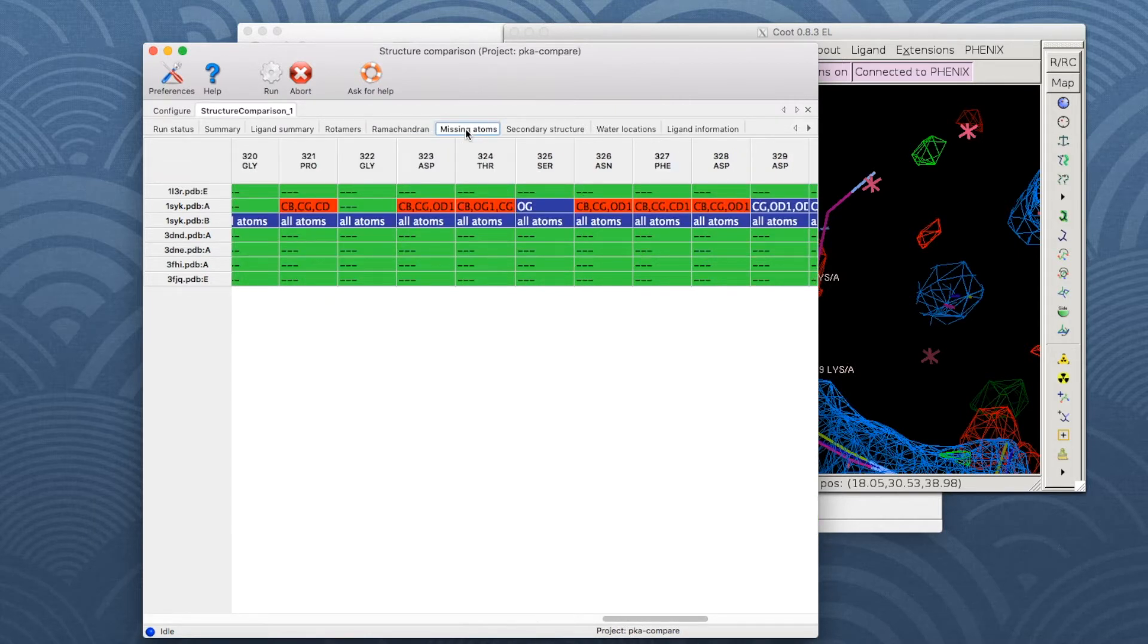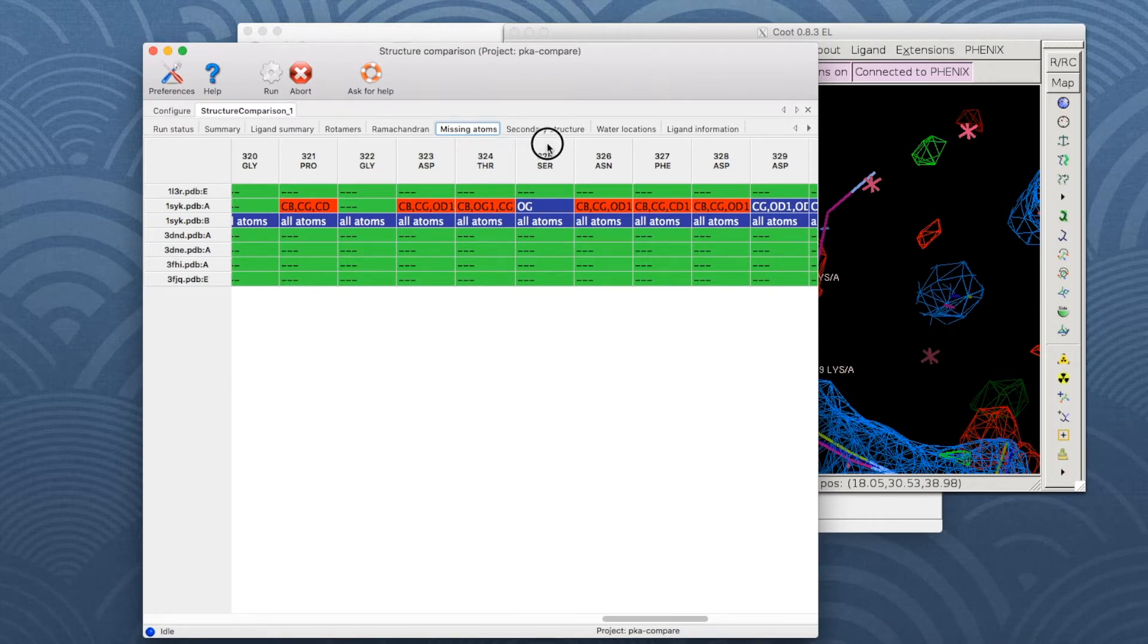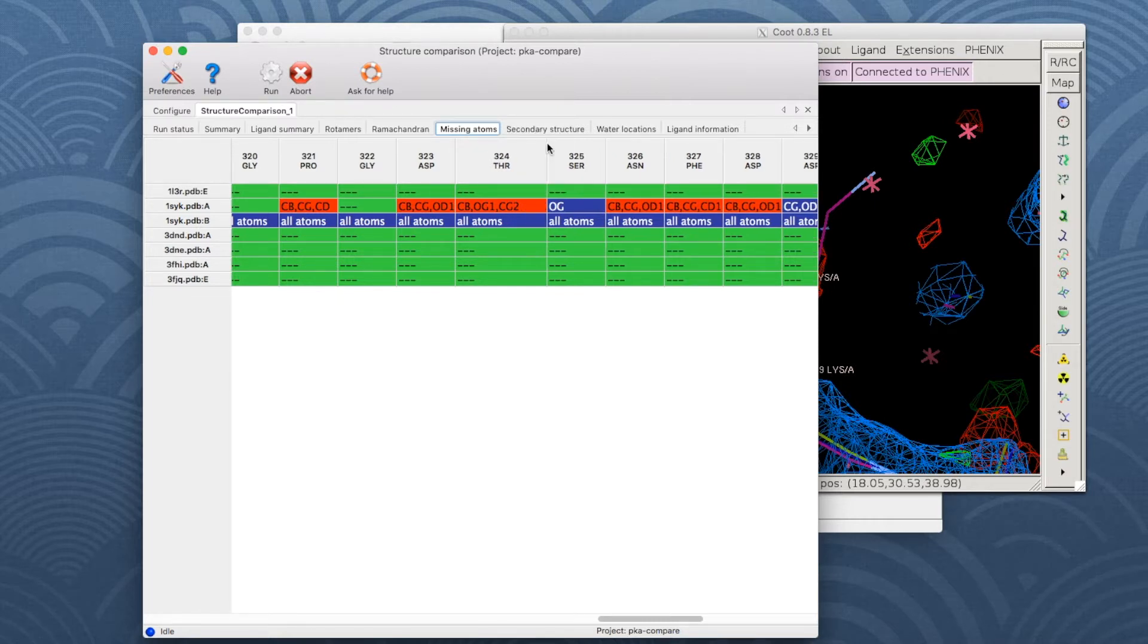The missing atoms table displays missing atoms or residues. The cell lists which atoms are missing. Note that the cell can be expanded to see all the atom names.